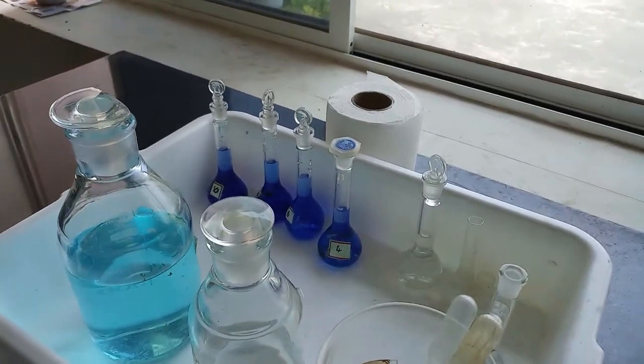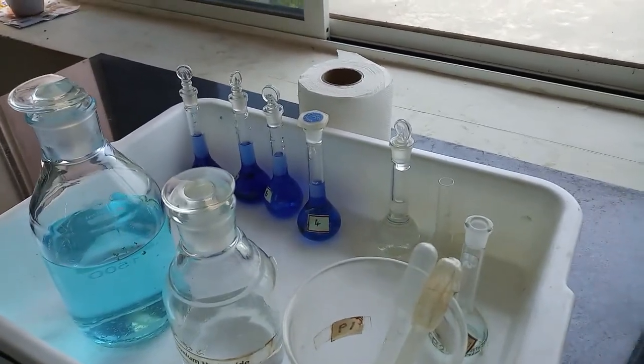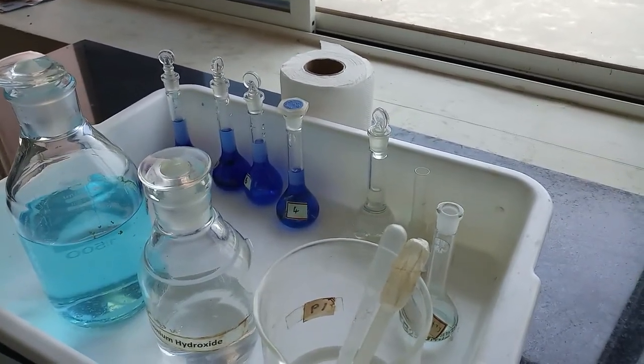Dear friends, in this video let us see colorimetric determination of copper. Here we are estimating the amount of copper present in the given copper sulfate solution using photoelectric colorimeter.